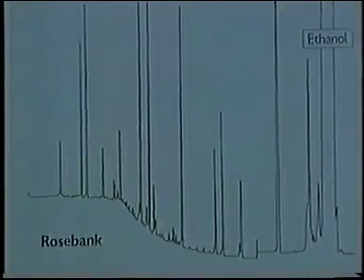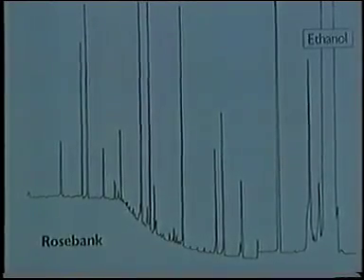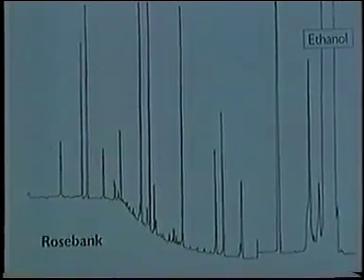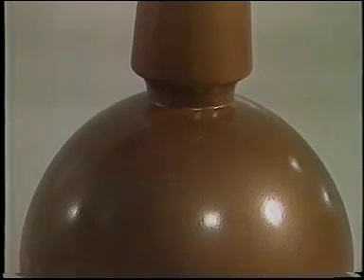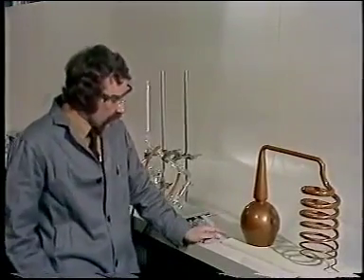This GLC trace of the Rosebank whiskey shows that the output from the spirit still, the third distillation, is almost pure spirit, ethanol, but that small amounts of other organic liquids are also present. How do we carry out a simple distillation in the laboratory? Well, this model of the Rosebank still shows many of the features.